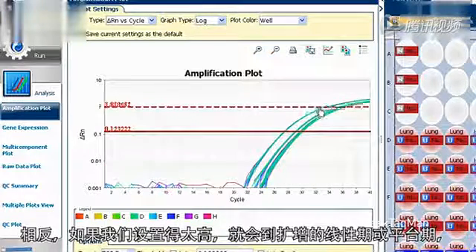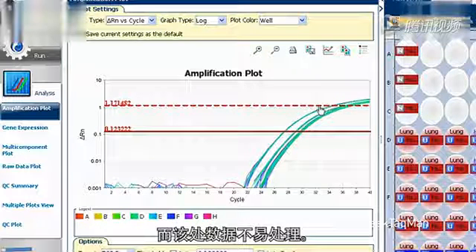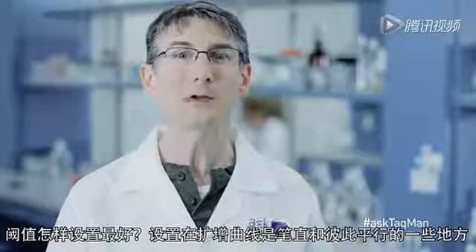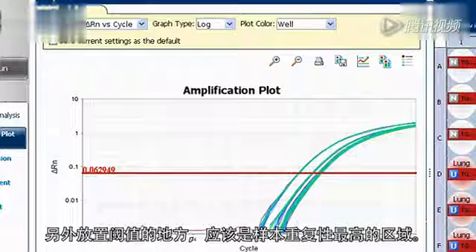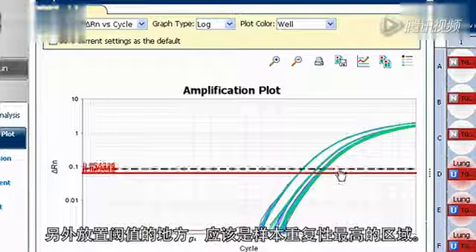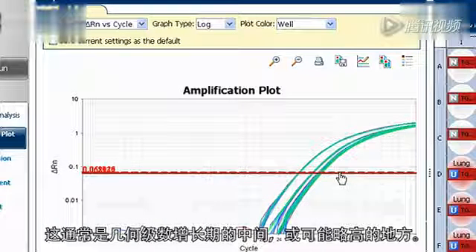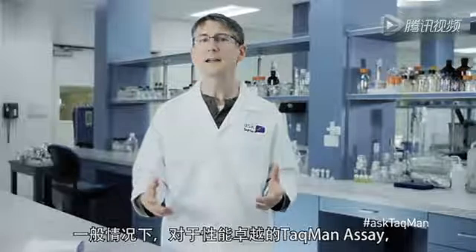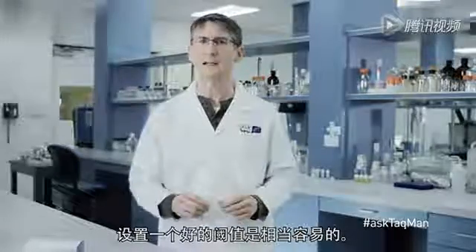Conversely, if we go too high, we're in the linear or plateau phase of amplification, where data are less predictable. A happy spot? Some place where all of our curves are straight and parallel to one another. What we really want is to put the threshold wherever the precision of our replicates is highest. That's generally somewhere toward the middle of the geometric phase, or maybe slightly higher. In any case, with a really robust assay, hitting a good spot is quite easy.